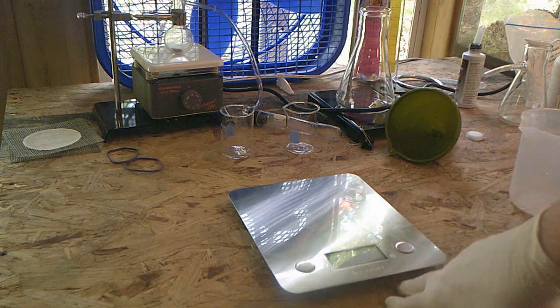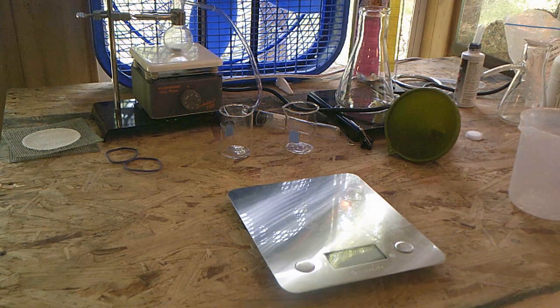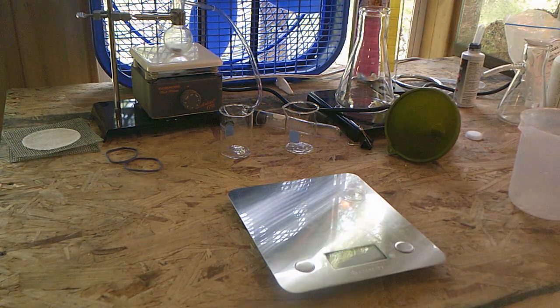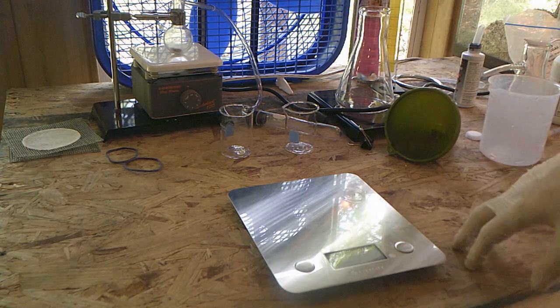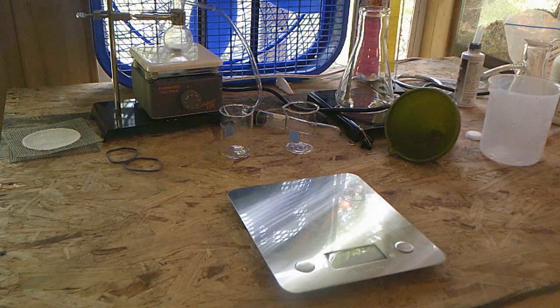First, we'll go through and create the chemical reaction. And then after that, we'll demonstrate it and talk about it. And then I'll talk a little bit about some of the dangers involved in these chemicals and how to dispose of it. This is a fairly complex reaction in the way it works out. However, it only involves three different chemicals.